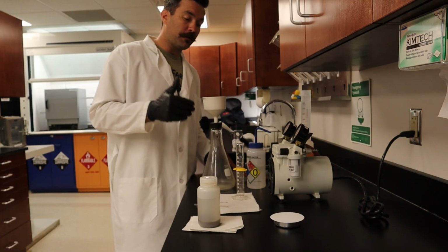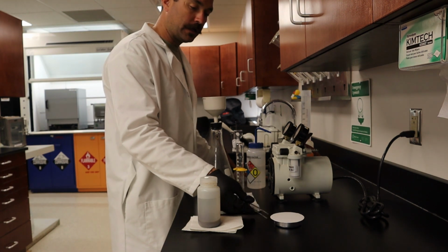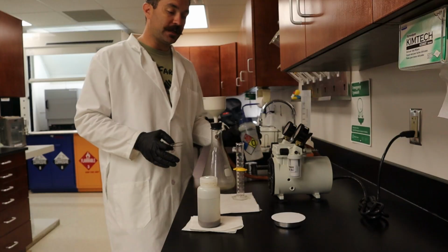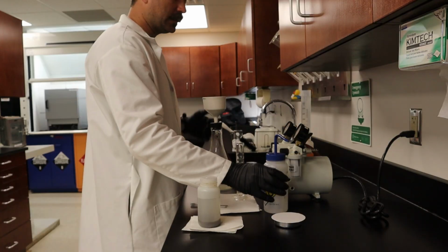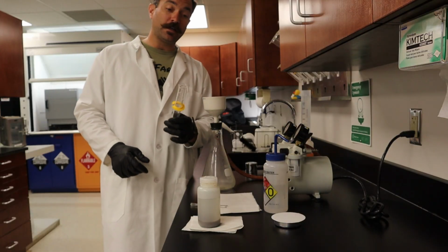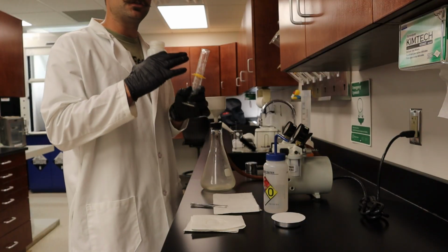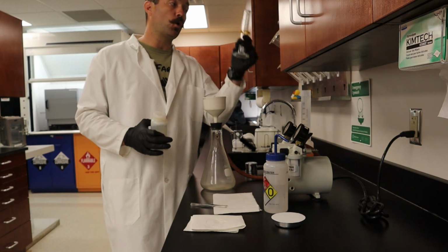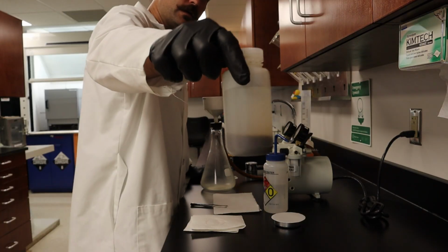Back over here at our vacuum pump and our funnel, we have our sample. We have weighed our filter here, so we know that initial weight. It's a very important part of the test before you get started. So next, let's go ahead and pour up our sample before we seat our filter. If you've seen our glassware video, you know that it's very important to pour this at a certain angle so that you can read the meniscus. You can see that bubble on the line you want. For this test, we are going to pour up 50 mils in this graduated cylinder. But as you can see, our sample has actually settled out.